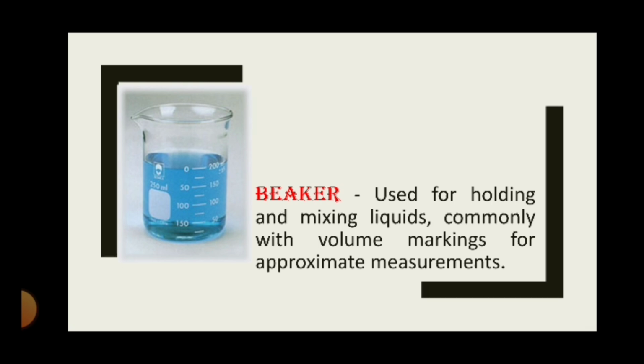It is used for holding and mixing liquids, commonly with volume markings for approximate measurements. Approximate, no? So meaning to say, kung kukuha ka ng ample volumes of liquids na hindi mo naman kailangan ng very exact amount, gamitin mo si beaker. Approximate lang, maybe just an estimate.